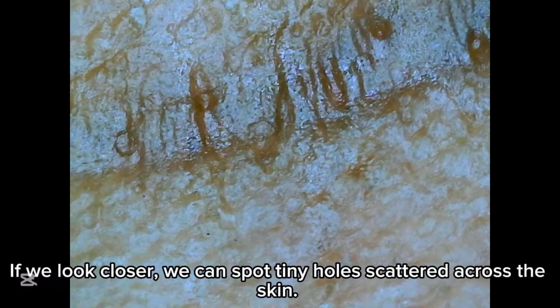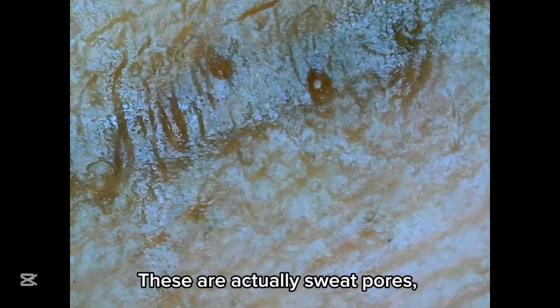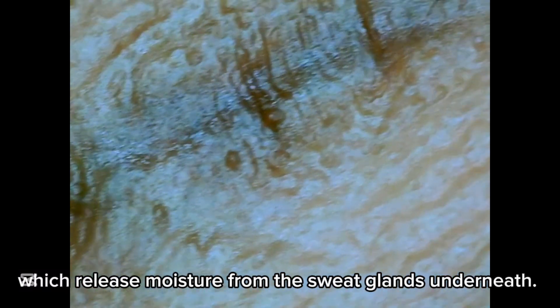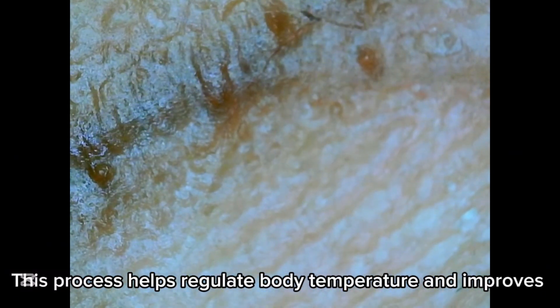If we look closer, we can spot tiny holes scattered across the skin. These are actually sweat pores, which release moisture from the sweat glands underneath. This process helps regulate body temperature and improves grip by keeping the skin slightly moist.